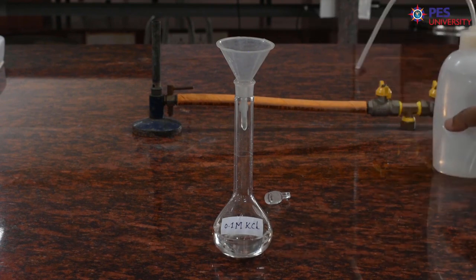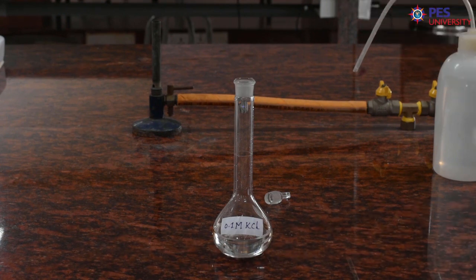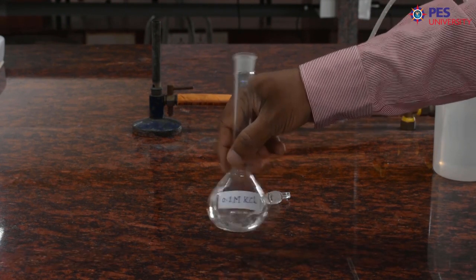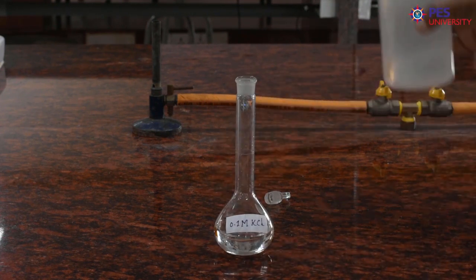After adding water, take out the funnel. Then swirl the flask. Then add one more portion of water.